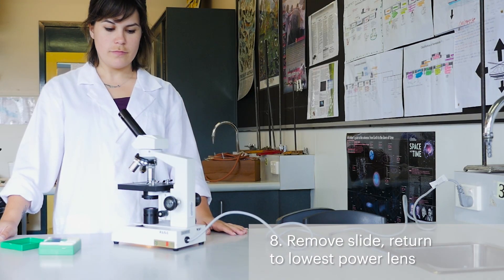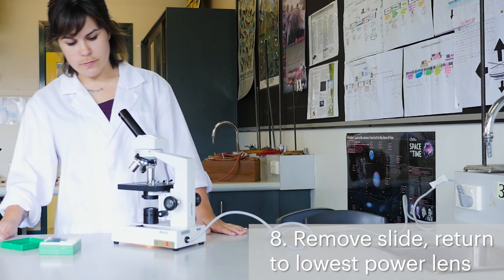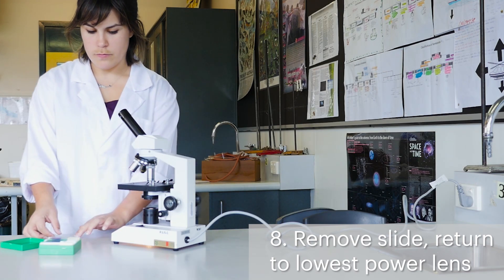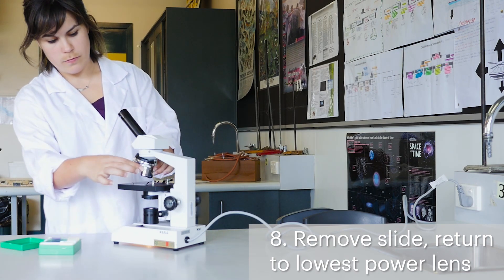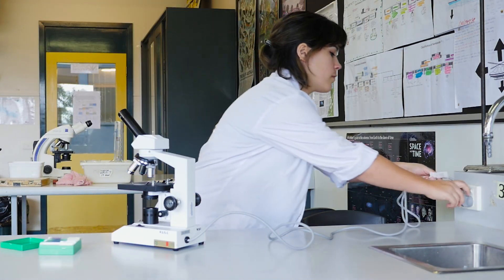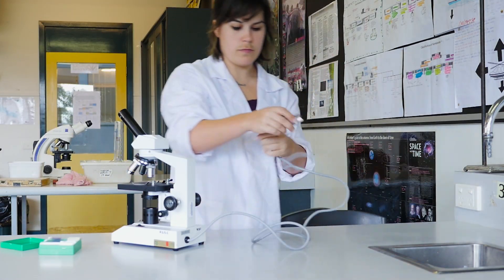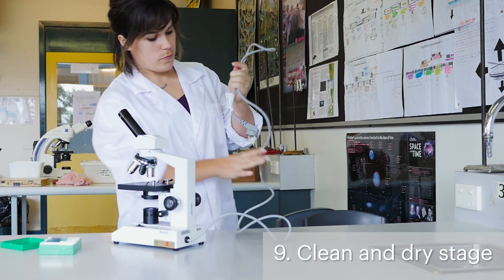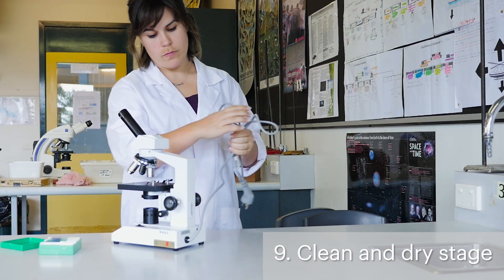When you've finished using the microscope, remove the slide and rotate the lowest power lens in place. Turn off the microscope and unplug it from the power source. Check that the stage is clean and dry. Wipe it with a cloth if necessary.